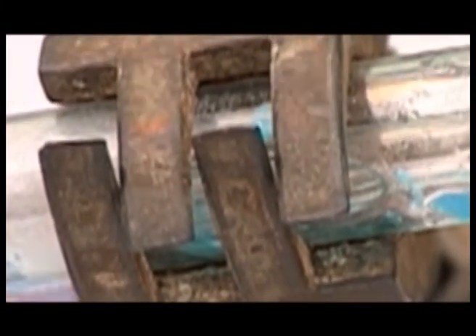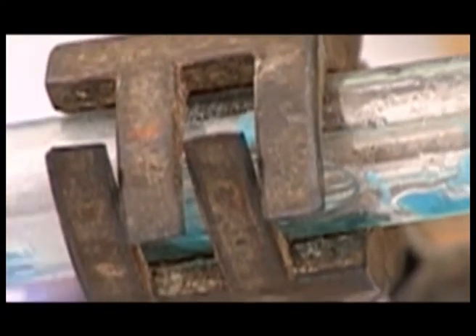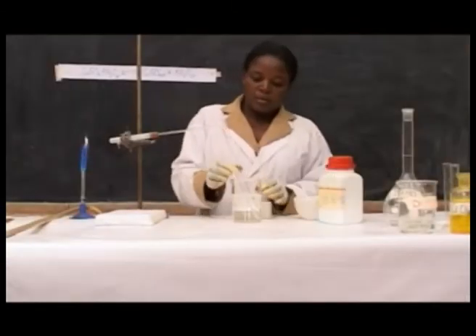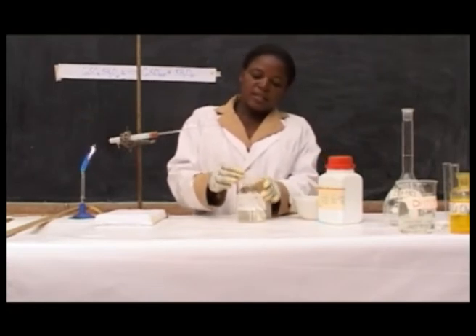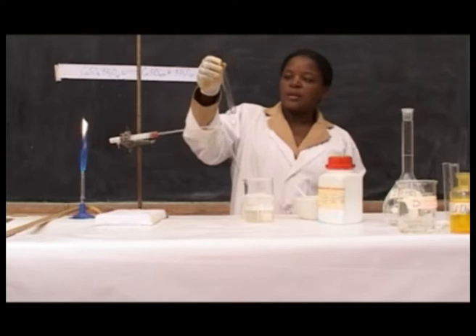Before, the salt was blue in color. Now here there is a residue of white color. Before, we had a dry test tube. Then let us see what happens with this test tube. You can see there is water.